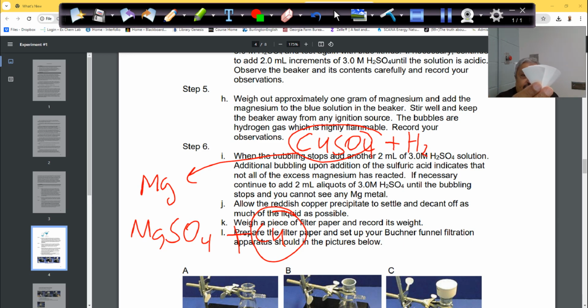Let me repeat myself. It is 50%, another 50%. Now I have almost a cone. Open it 3:1 ratio, take 3 sides to one side. Here I have a funnel. This filter paper has to be pre-weighed. You have to know the mass of it to begin with, otherwise your calculation will be wrong. And do not overheat it, because if it's barbecued, then the whole experiment is gone. Your data is not good.